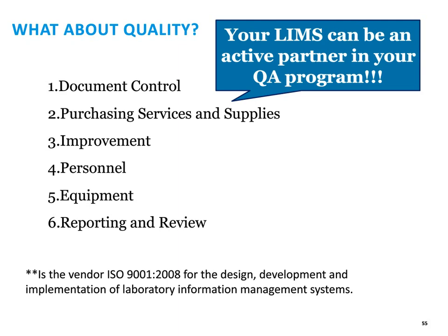Everything's linked. Documenting your personnel's training records, what they're certified to utilize, and what equipment and analyses they can conduct. For example, if we do have an analyst that we've hired and maybe they haven't been certified to perform every analysis in the system, your LIMS should be able to limit them just to those things they've been certified to perform. Same thing with equipment. And then, of course, generating our examiner reports and our technical reviews. If all of that can be done electronically, it's a real value.